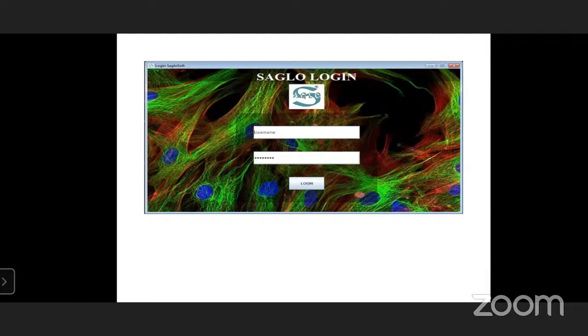So this all key points are important for the validation of this particular software according to the US FDA 21 CFR norms. So we designed this software according to these norms. When you see the particular slide which shows the login system, त्या लॉगिन सिस्टीममध्ये एक ऍडमिनिस्ट्रेटर लॉगिन आहे. That administrator login is our company. We first of all login into that software and after the login we generate a username.